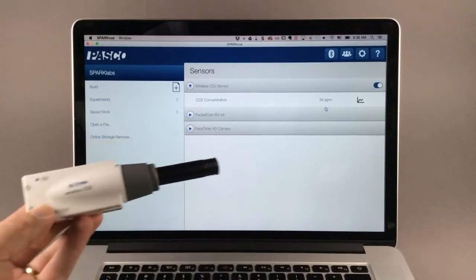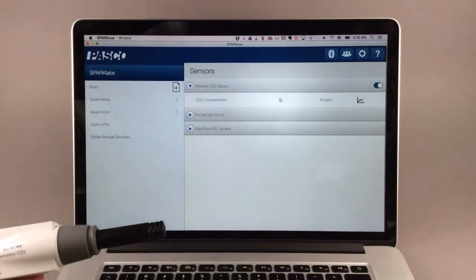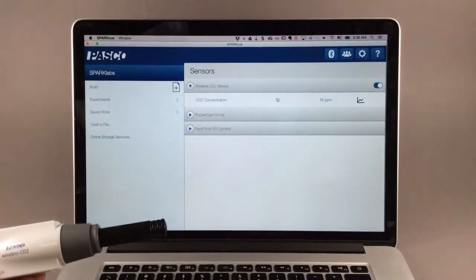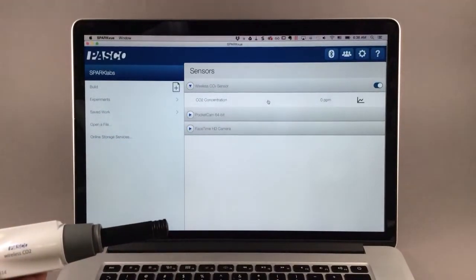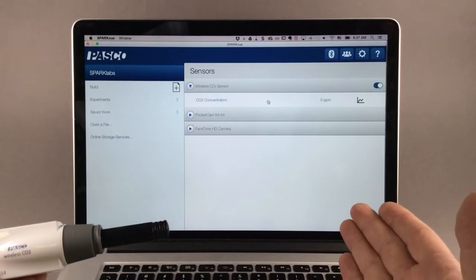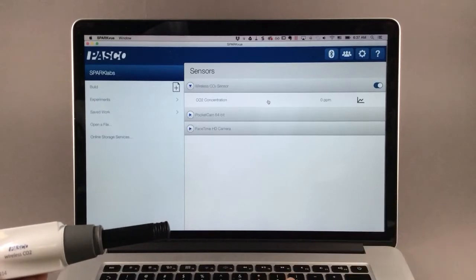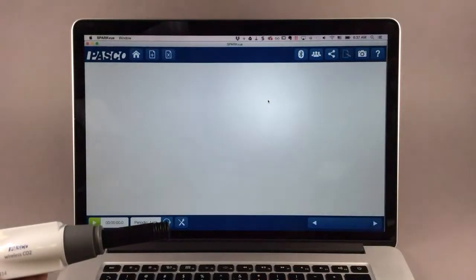To do this in SparkView, you'll need to have connected the sensor and then go into a file. I'm not in a file yet, I'm on the home screen, so I'll click on the CO2 measurement.